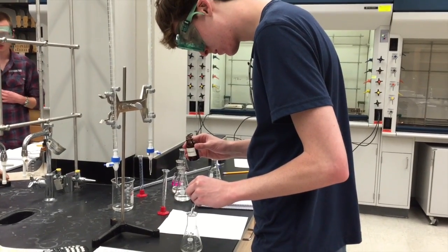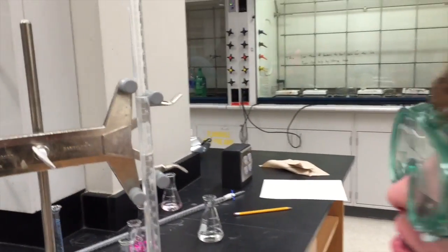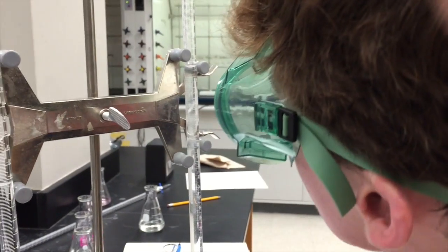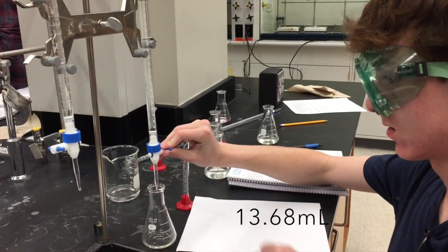Add two drops of phenolphthalein as an indicator to the Erlenmeyer flask. Record the initial volume to one degree of uncertainty past the graduation on the burette. In this case, record to the hundredths place or two decimal places.